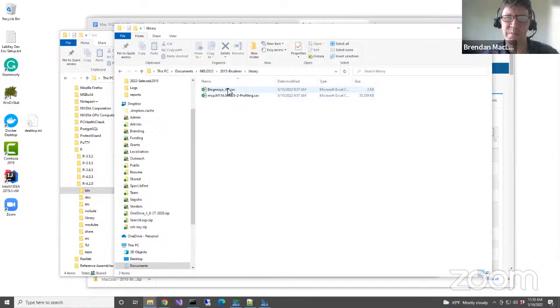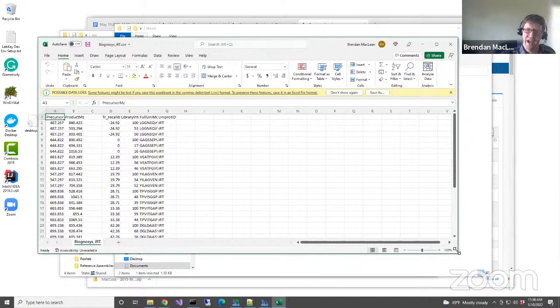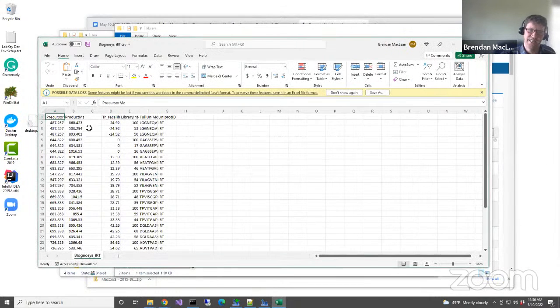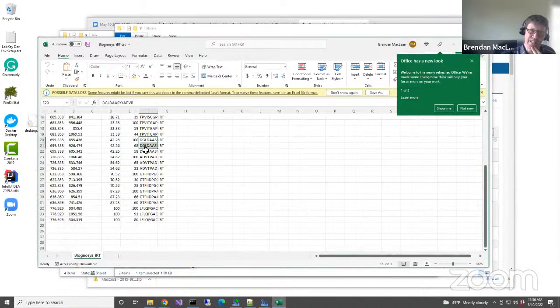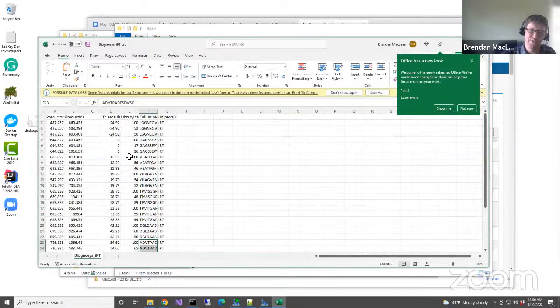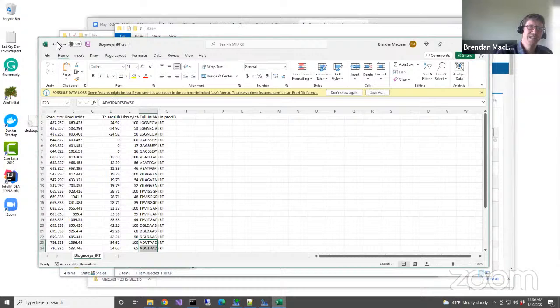Here in the library, we have this Biognosis IRT CSV. And I think it is actually pulled from the Biognosis IRT standard specification. It's just a small 34 line file that specifies all 11, and it actually only specifies 3 transitions for most of the peptides. So it's just saying, hey, this is what I want to measure for my IRTs. And if you choose the default, then you'll get what Skyline has. And if you just choose, I said, before I chose the CSV, I say you could choose this 11. And then I didn't, and that was because there was a bug in that last year. I think it's probably fixed, but I didn't retest it.